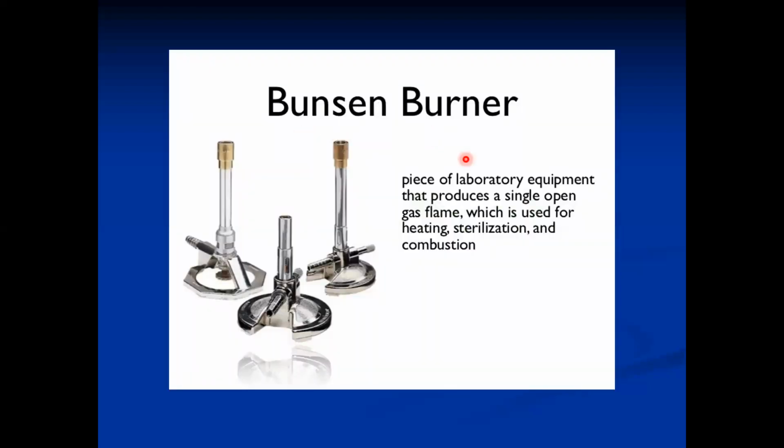Bunsen burner. It is also an important component of the lab. It is used to heat the test tubes or to heat the beakers or any other container. It is used for heating purposes.